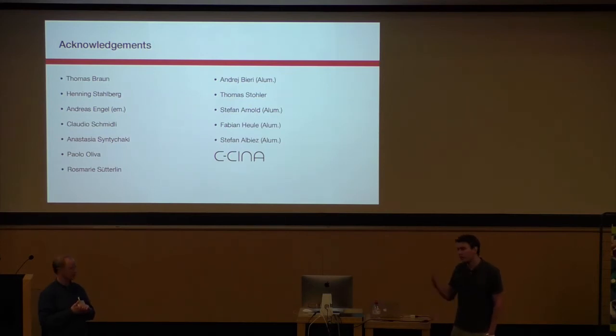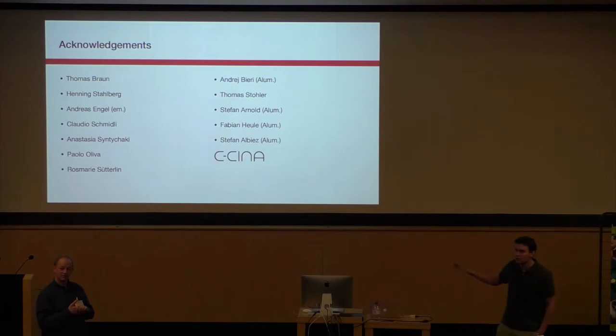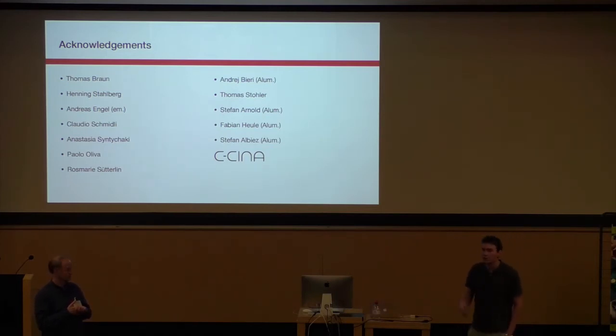But I am thinking on adjusting some stuff on the motors, and then I can go also faster. But at the moment I fixed it at 360 milliseconds. With the current setup, this is what is more or less possible. But it could be better, but then I need to improve some stuff with the motors first. Yeah. But then it's still interacting with the air sometimes. Yeah. You cannot avoid that.